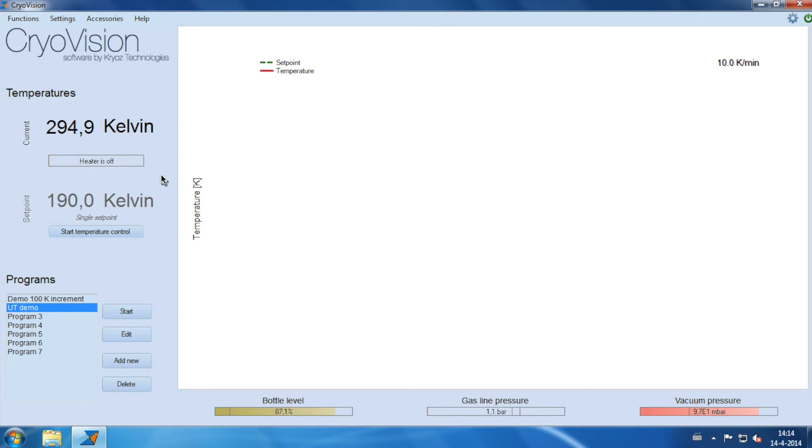At the moment the system is in single setpoint mode, as is shown here. You can change the current setpoint by simply changing the value.